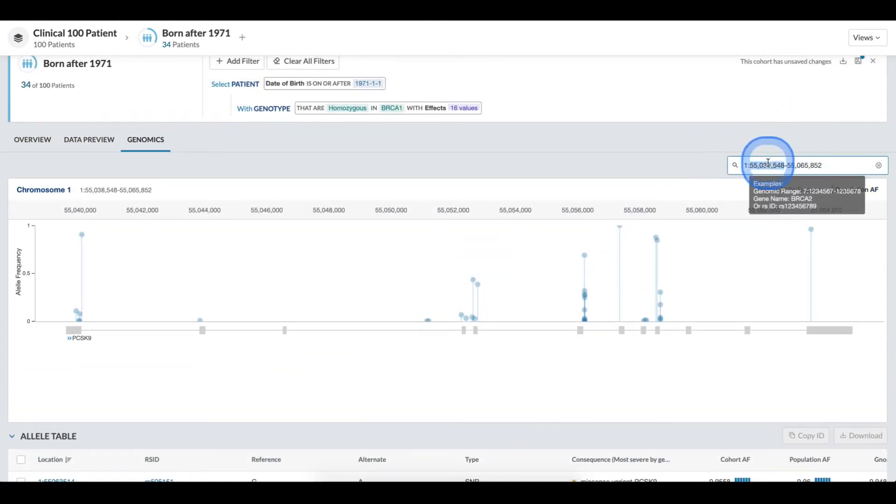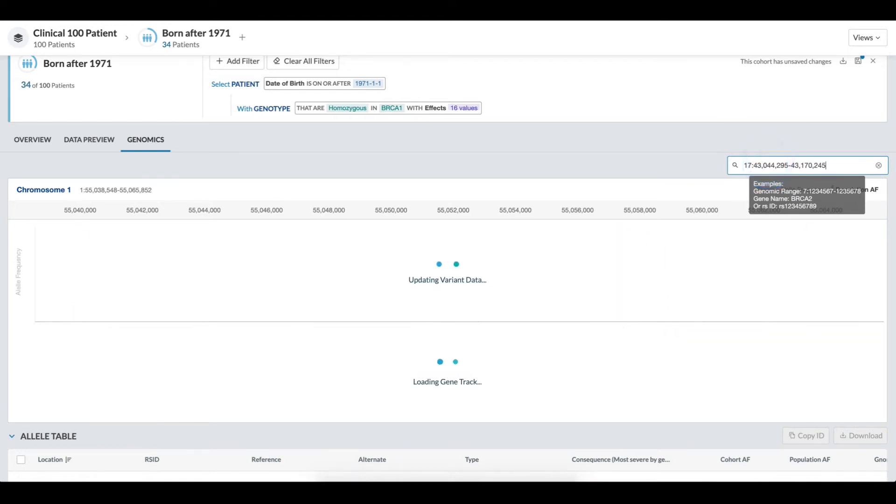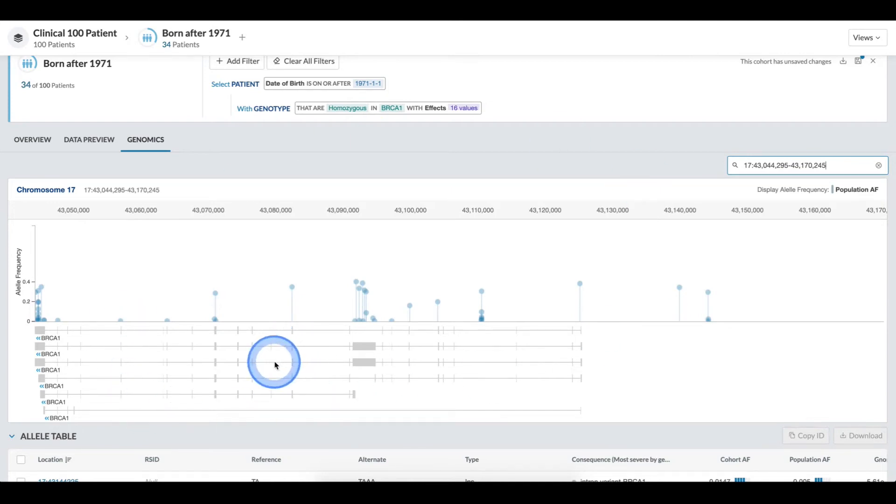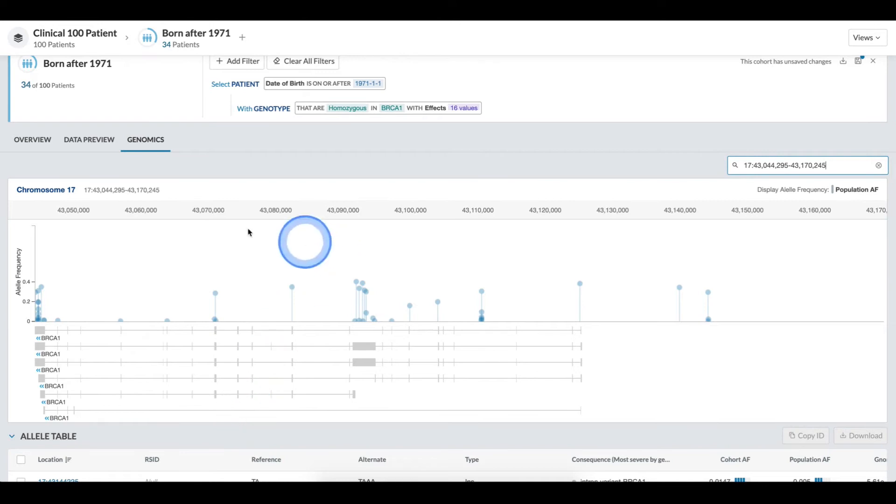Since I'm interested in BRCA1, I can come in here and type in BRCA1 to shift this region of interest. Now I can see my gene tracks along with my frequencies.